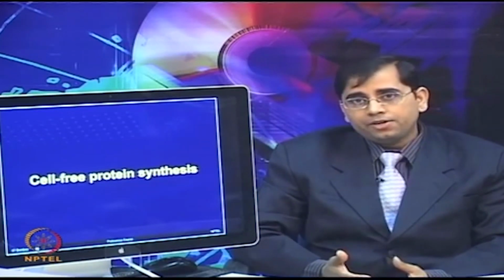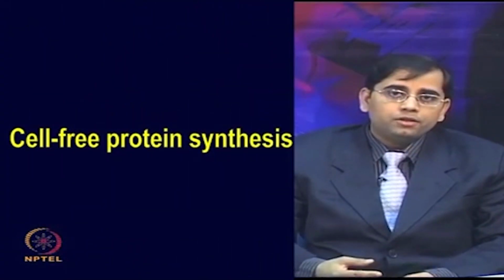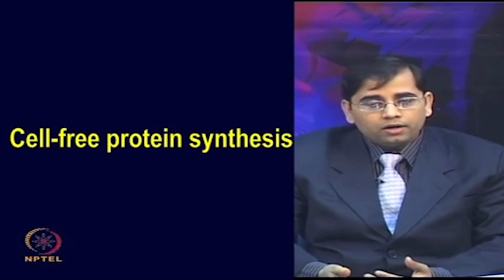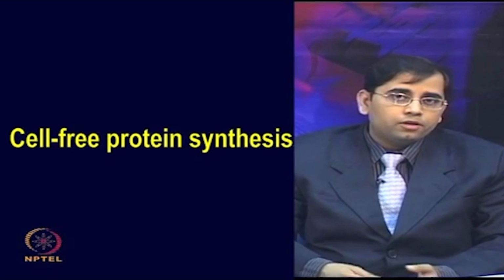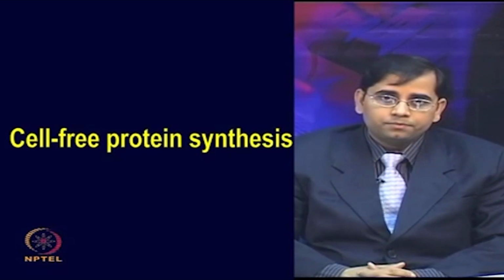Now you have generated a lot of master clones, which are gold clones, these repositories, and one can use these cDNA clones for various applications, including protein microarrays. One can transfer these clones into the right expression vectors and purify the proteins, or use these vectors for producing protein using a cell-free protein synthesis system.